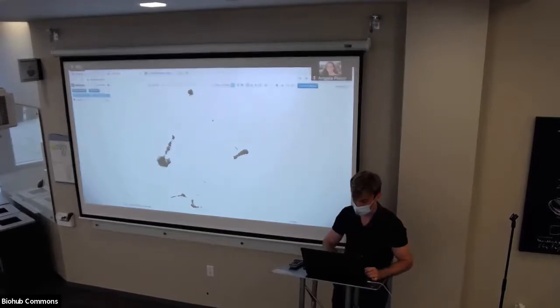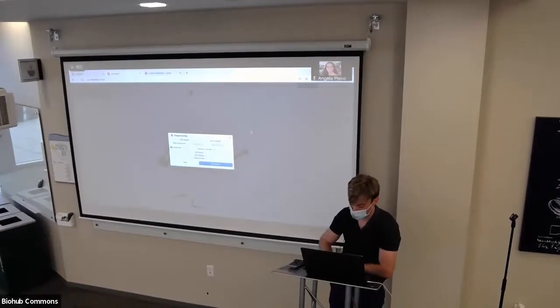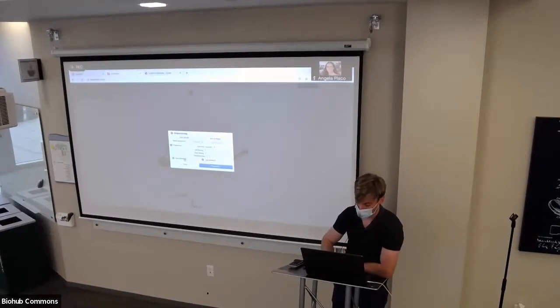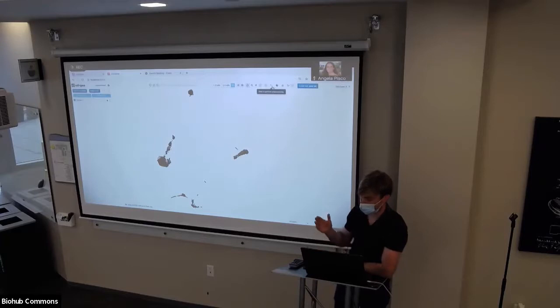Someone is asking what the second step is after hitting this. You hit sum normalize, log transform, then you just hit preprocess. Sometimes there might be a little bit of a delay for the front end to communicate to the back end because it's all getting piped in through this local networking interface, which in the future I'm hoping to change to be a more direct communication. So if there is a delay, maybe just wait it out. And if it's taking forever, that's a problem, and I'll have to look into that.